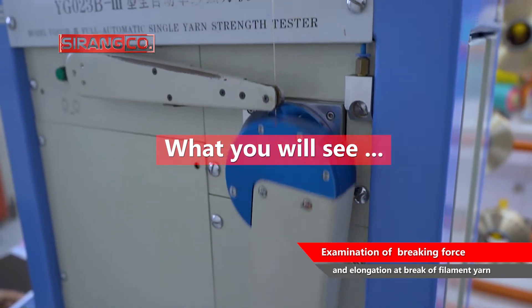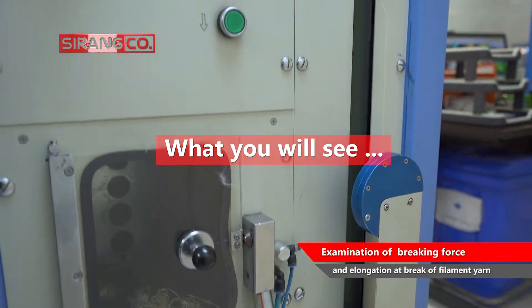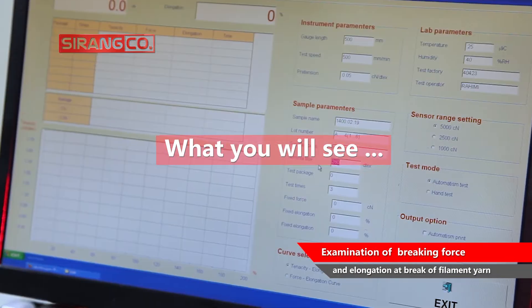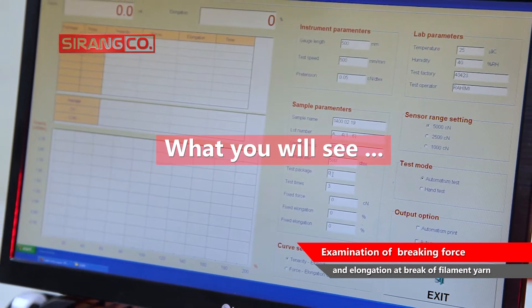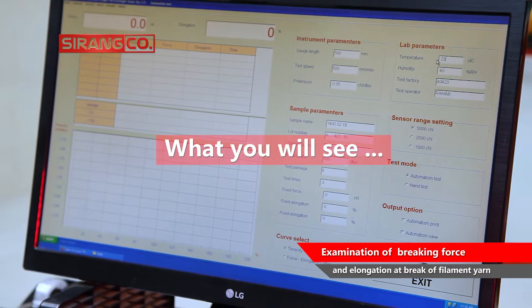The function of this device is such that one end of the yarn is placed in a fixed clamp and the other end is placed in a clamp that moves at a constant speed. This device is fully automatic and is equipped with a system for displaying and recording the breaking force.